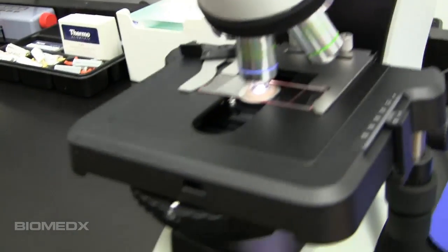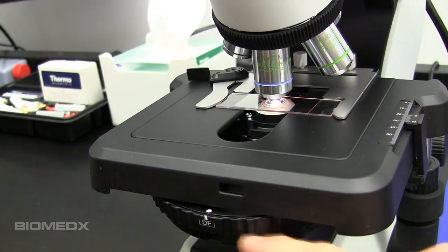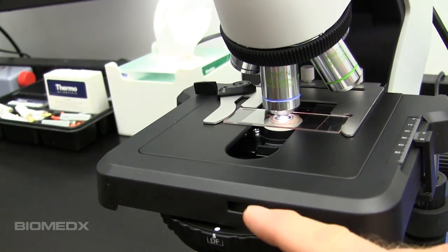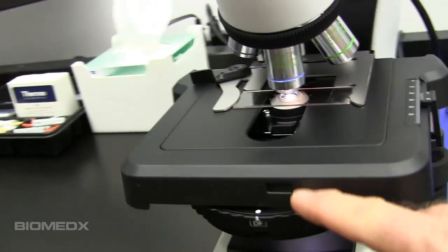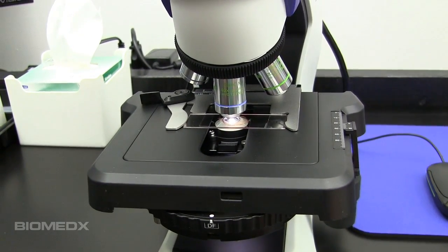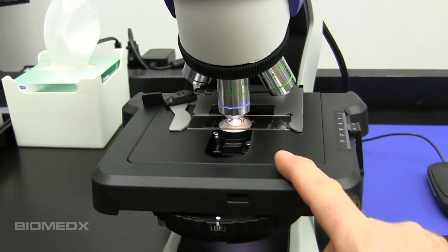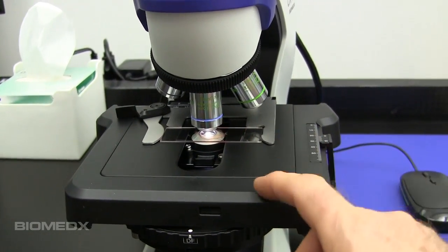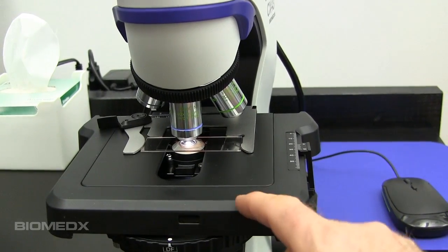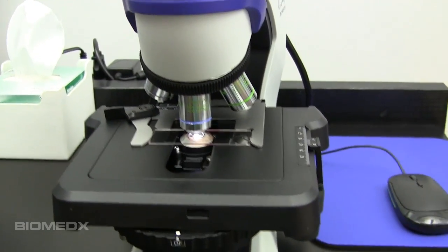That's all accomplished with the universal turret condenser, which is right here. This is actually fixed to the stage — does not remove, does not move up or down, it's fixed in place. Which is very nice, because once it goes out to an individual and they're working with it, it is consistent. They will always be getting the very same image. You can put one tech after another in front of the scope and they will get the same consistent image every time. It's almost impossible to screw things up.